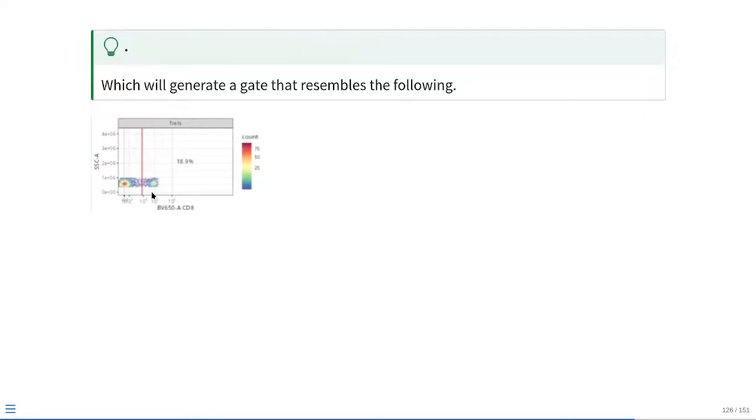You'll need to figure out a different option in this particular case. But this is a pretty good example of drawing a separation between your positives and your negatives. Obviously, if you're drawing this by manual gating, you may want to tailor this over a little bit here, or vice versa, a little bit upper end. You can get the same effect by using the gate constraint arguments, which we'll see in just a couple minutes, but you can see it does a good enough job for this initial gate that's being applied.